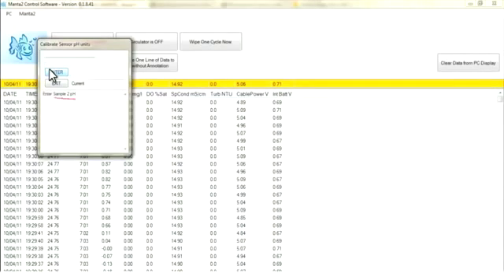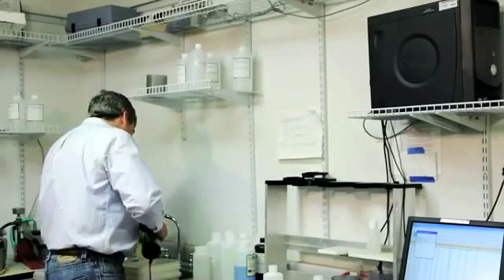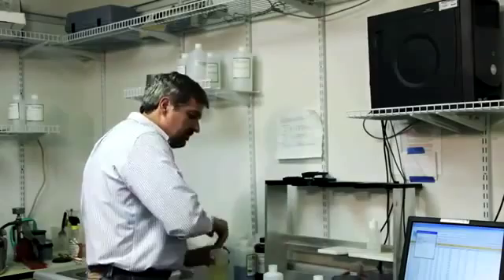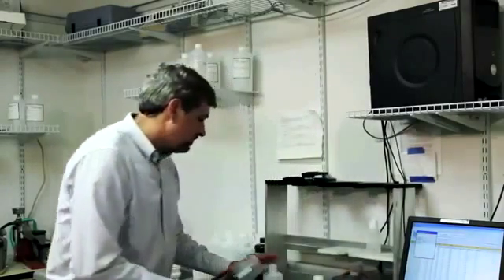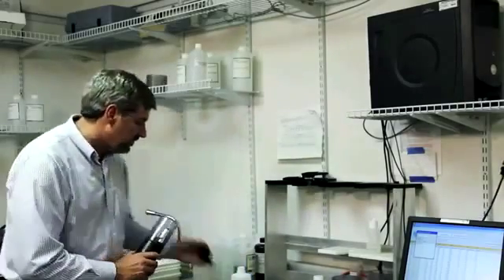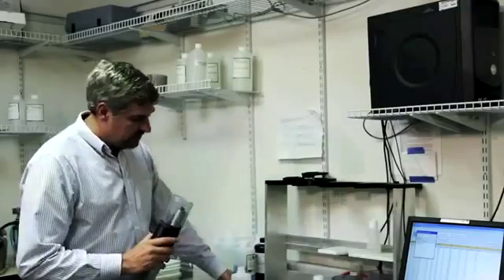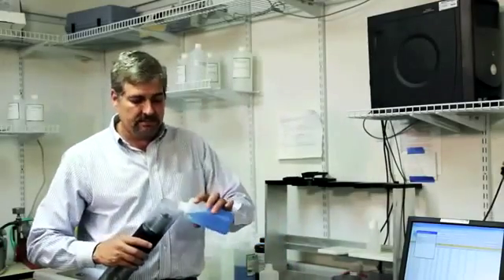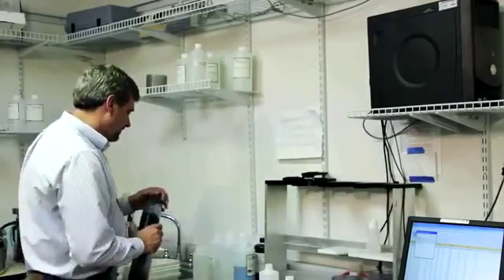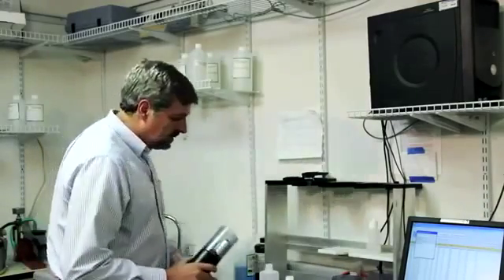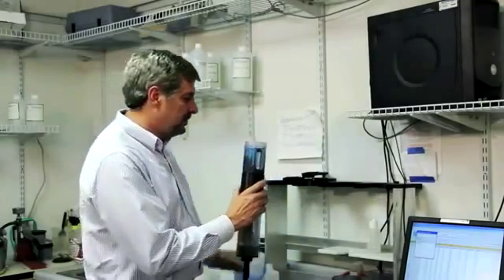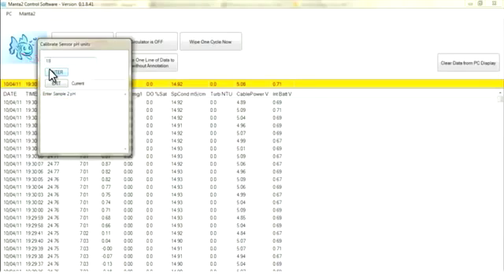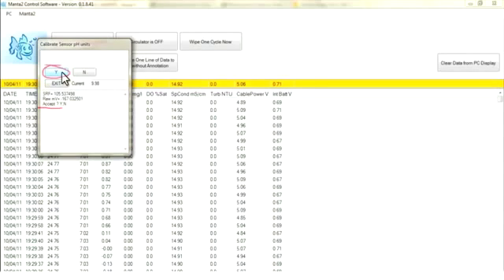Now it says enter sample 2. Rinse. I would do it twice. I'm not going to. I'm using my ten buffer. Rinse. Cover up my sensors. Put in my ten value. Hit enter. Wait for the graph to stabilize. Enter. Accept. Yes.